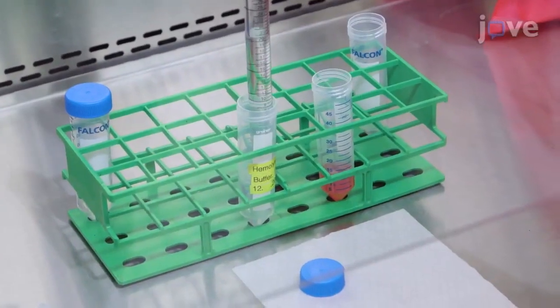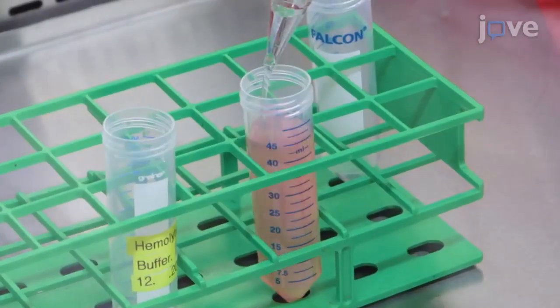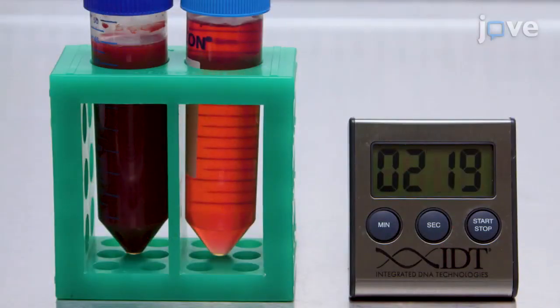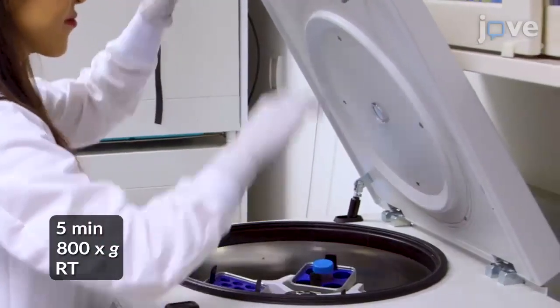Add fresh hemolytic buffer to bring the volume up to 50 milliliters and incubate the cells for another 5 minutes at room temperature before their collection by centrifugation.